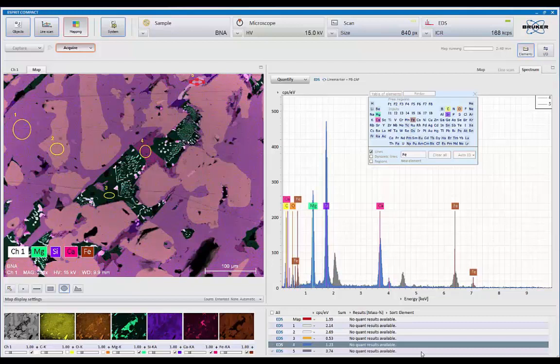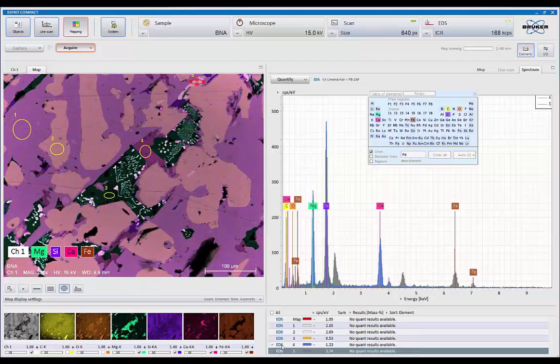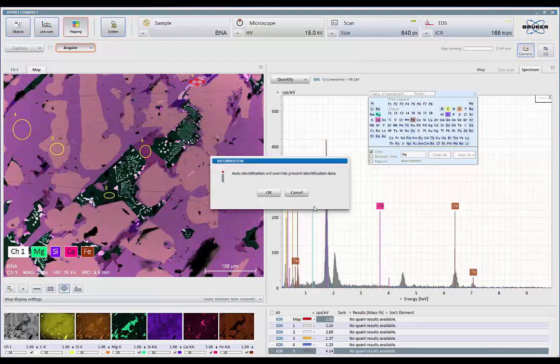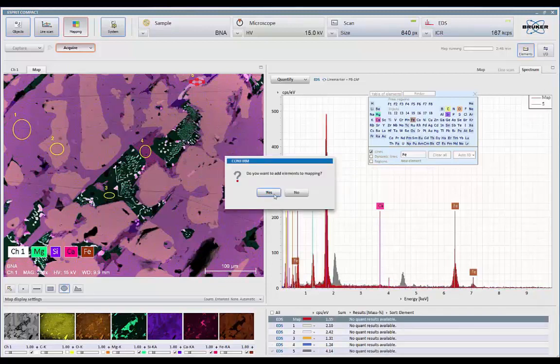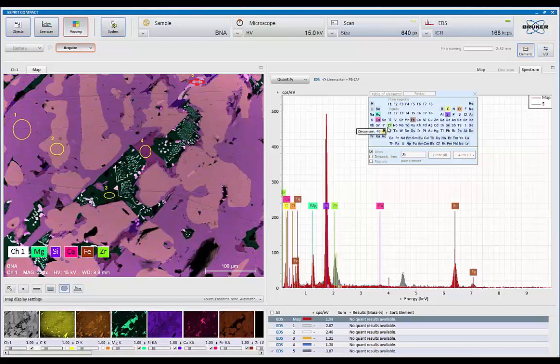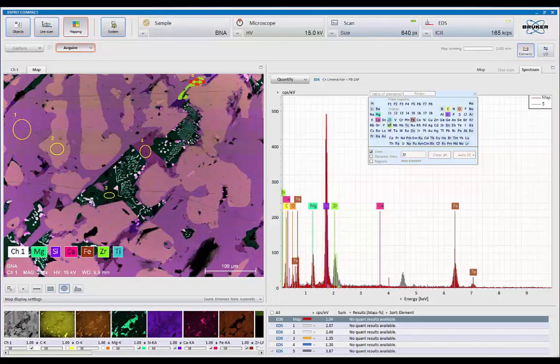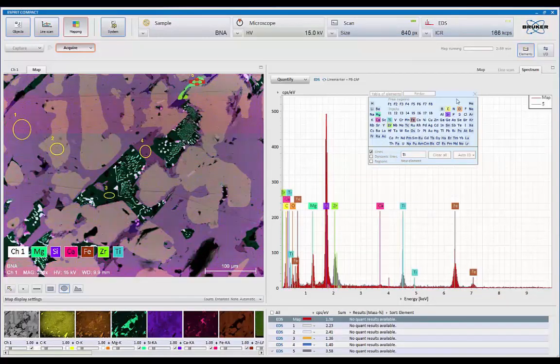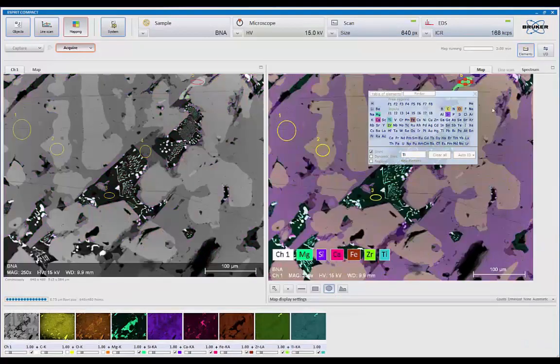And now we've got an entirely different spectrum. So in this area, again, we'll let Auto-ID take a quick look. And we see that we've got zirconium coming up. And we've got a little titanium peak.